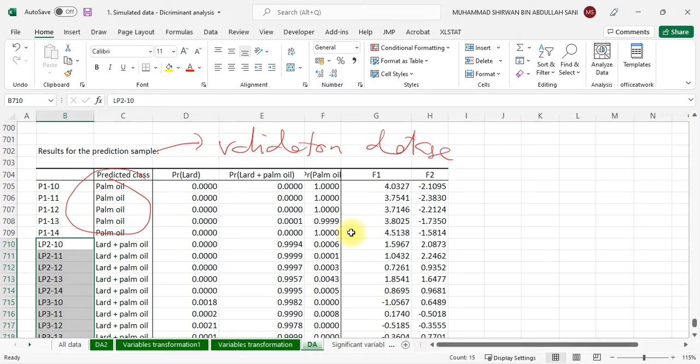If you are preparing fresh, perhaps you have higher accuracy. But if you have that cosmetic, which we know has a shelf life of 6 months, and you run again after 2 months, run again after 4 months, definitely you will not get the 90% anymore. Bacteria will start to grow. They also have their cell wall. They also have their own fatty acid. They will contribute their fatty acid to our cosmetic product.